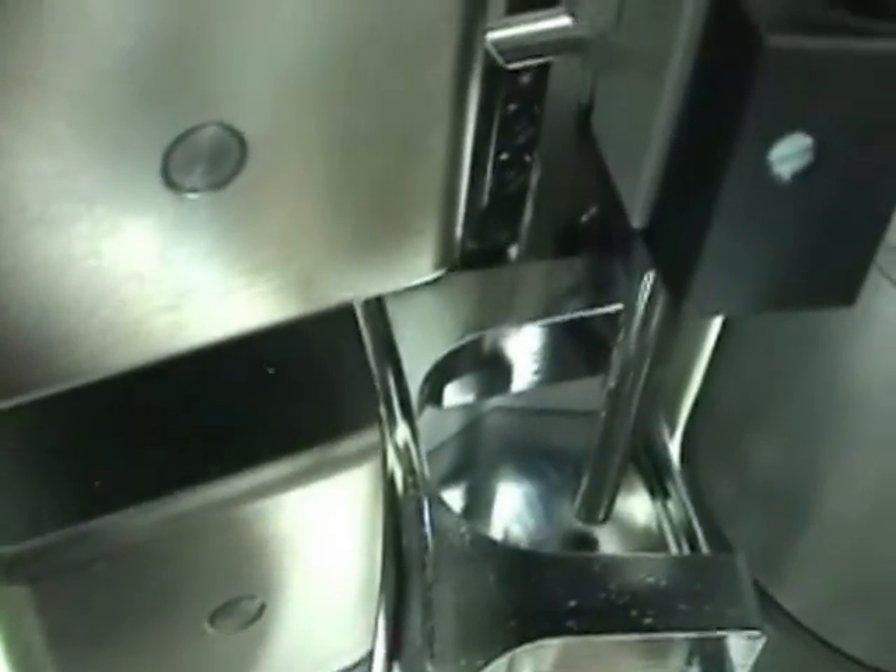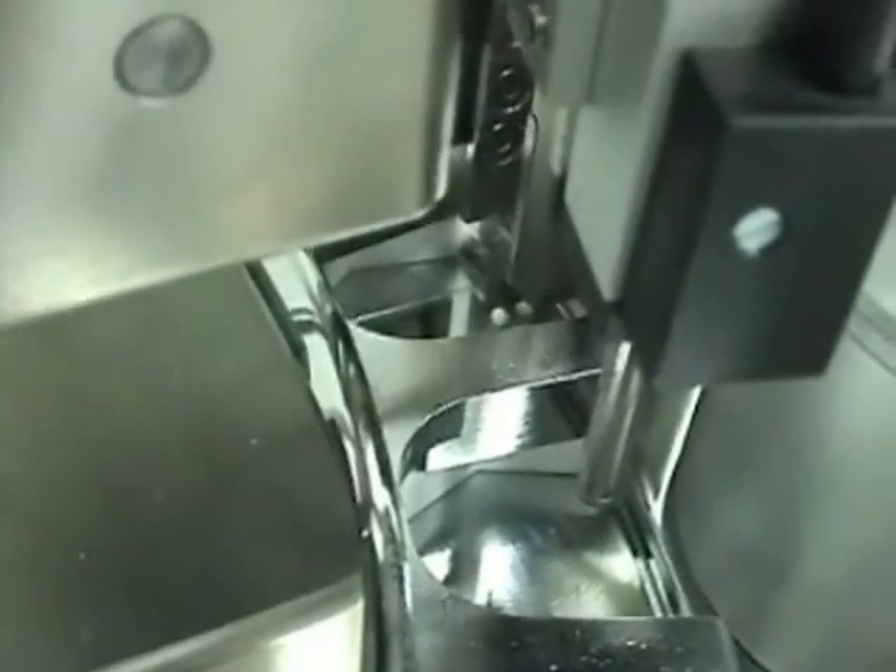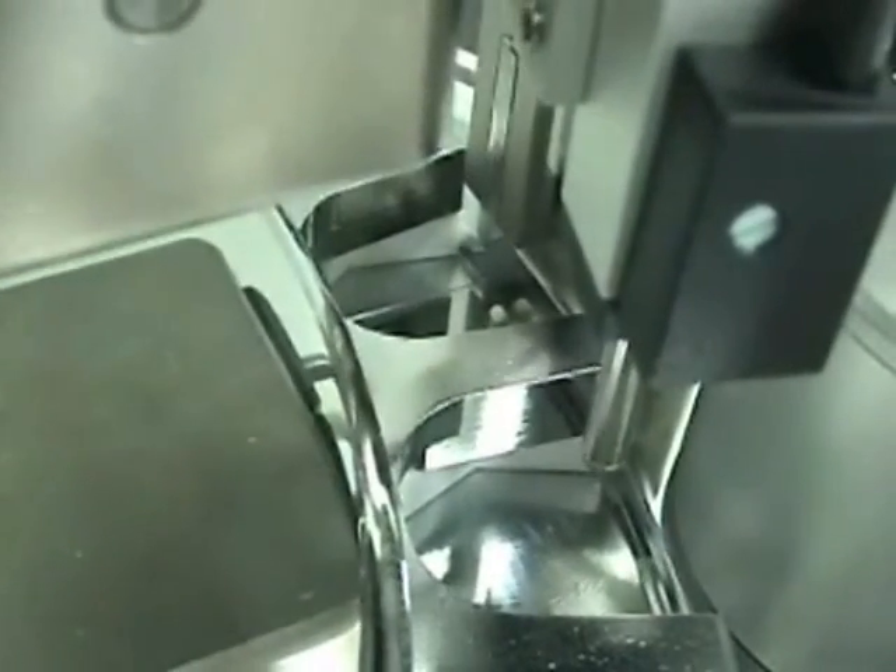Coupled with a device called the OZB, this allows for correct positioning at the hardness station, seen here.